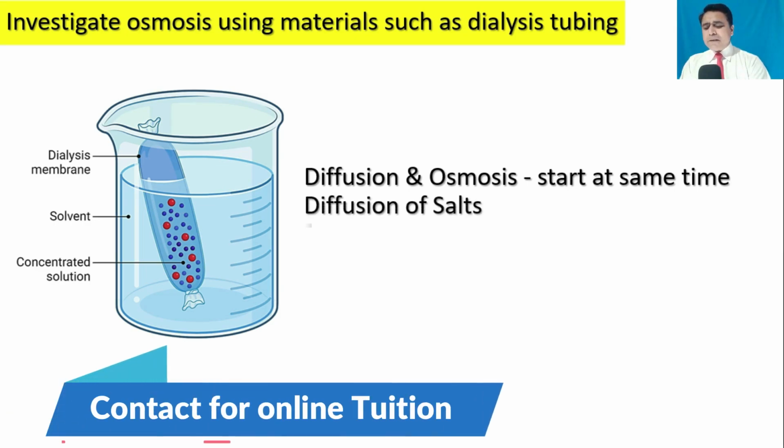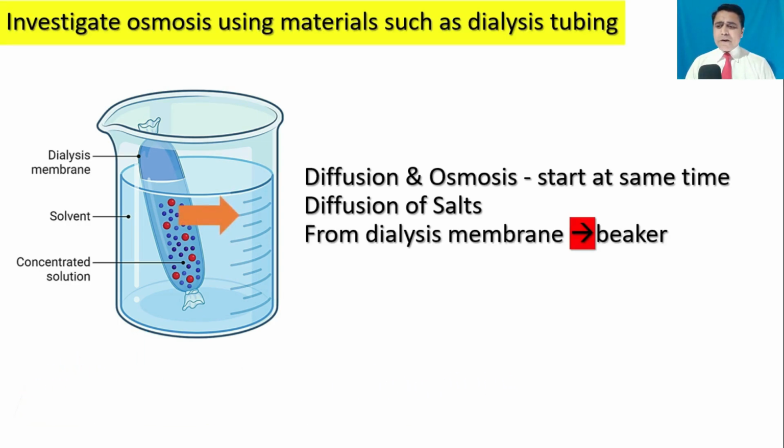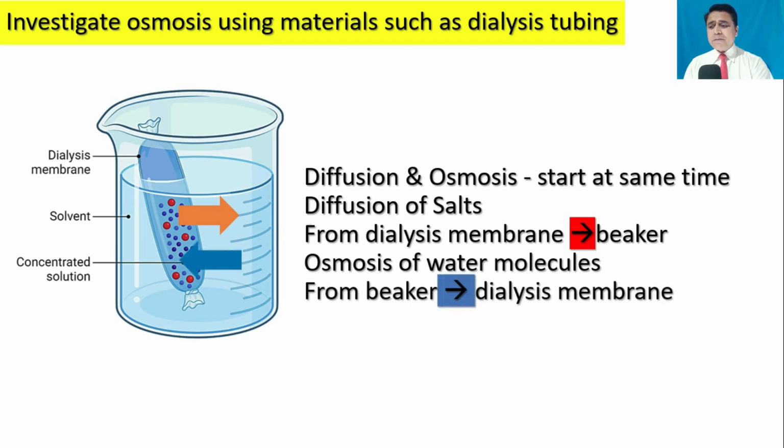Diffusion of salts: salts diffuse from the dialysis tube to the beaker. And osmosis of water molecules: water molecules move from the beaker to the dialysis tube or dialysis membrane.